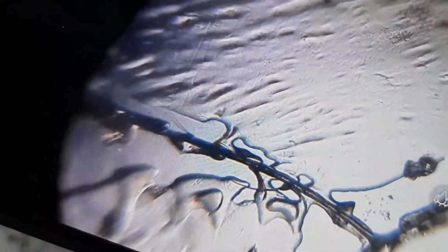So this is the wings of the Neuroptera, as I showed you before. It looks like a hair in the wings, and here in between the canals, there is a tiny little transparent tissue-like space.